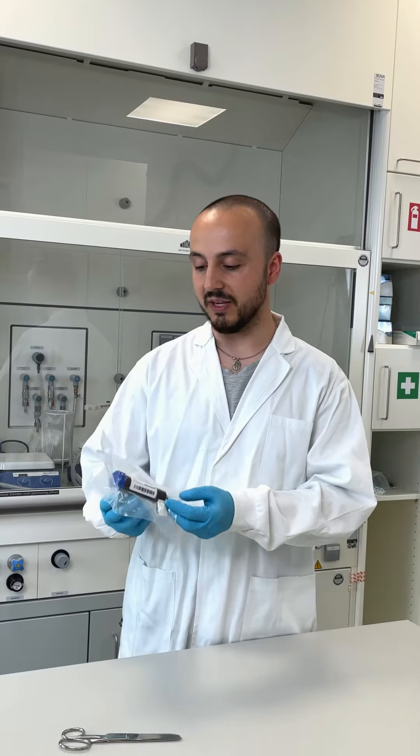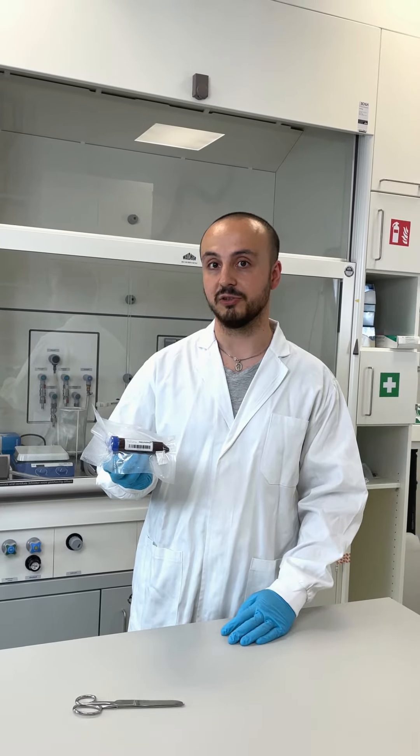When your order arrives in your lab you will receive the DMA slide packed like this. It is individually packed under dark and dry vacuum. The unique ID helps you to trace back your experiments. It is also part of our internal quality control.